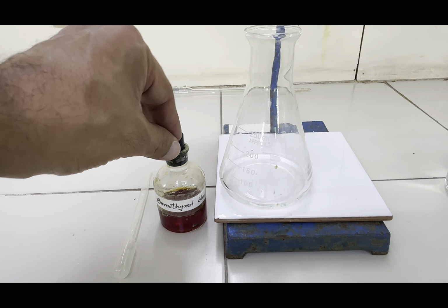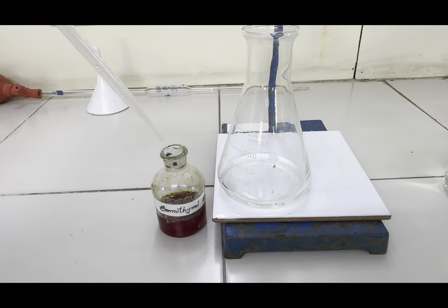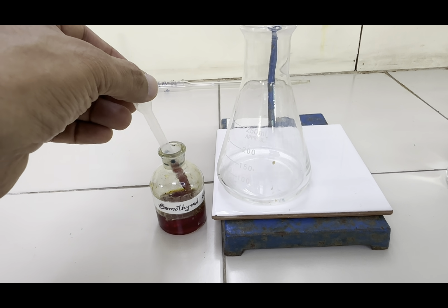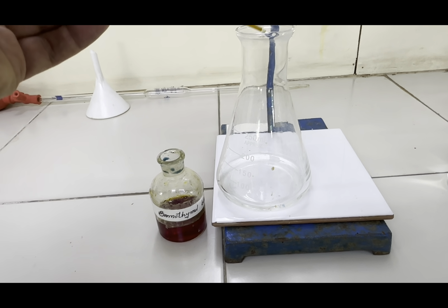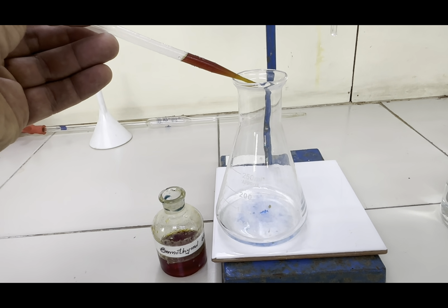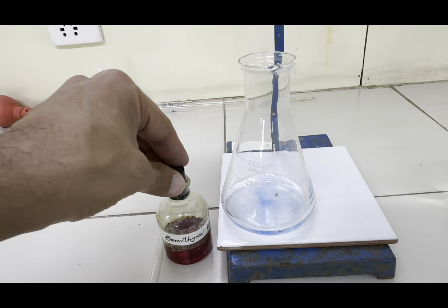So here is our bromothymol blue, and by using this dropping pipette, if a dropper is not already there, you can use this dropping pipette, or else there is always a dropper in the indicator solution. So we will add few drops. Now, what is meant by the term few drops? Few drops means 3 drops maximum. Few means 3 drops. 1, 2, 3. So 3 drops, and we have seen that the solution has turned its color to blue.